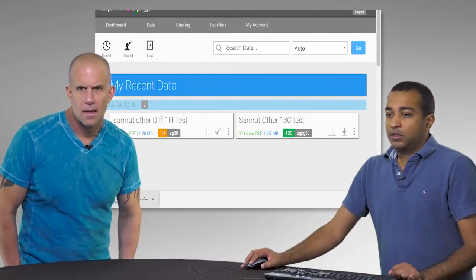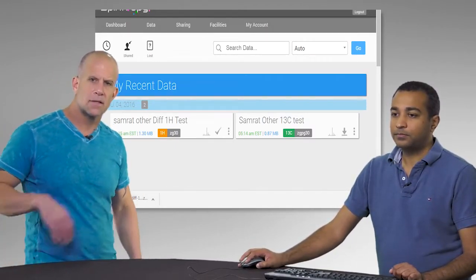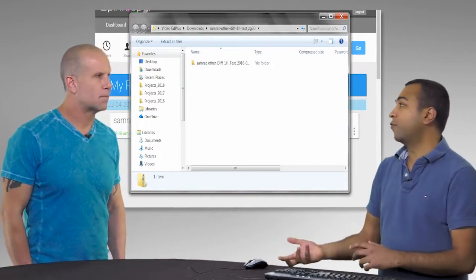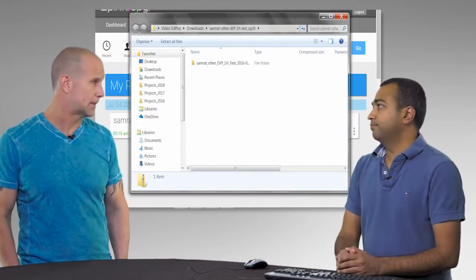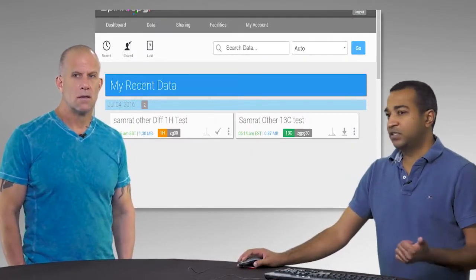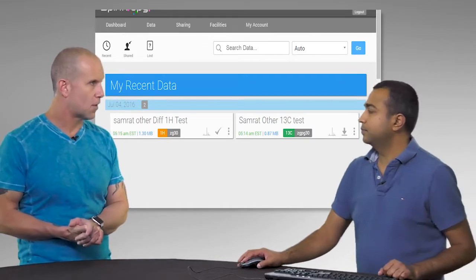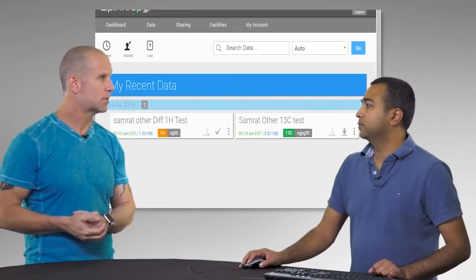If you open this file, it downloads as a zip file, and it's in Bruker format. So it's really meant to be opened in TopSpin. You can open it in MNOVA, TopSpin, anything that natively reads Bruker. TopSpin is Bruker's native software, and if you were to double click on IconNMR, that's what it would pull up as well. Exactly.